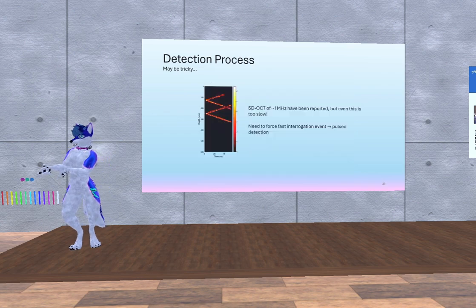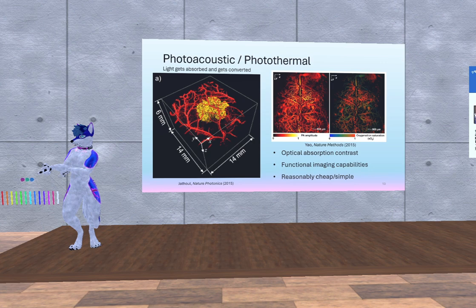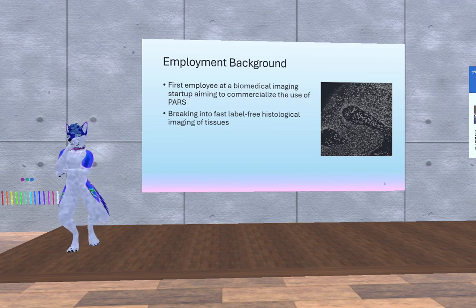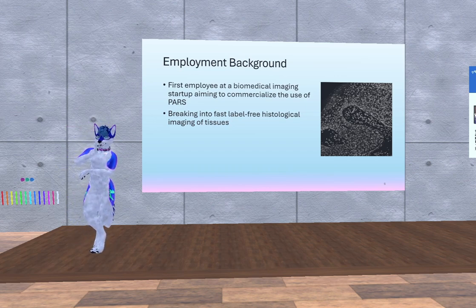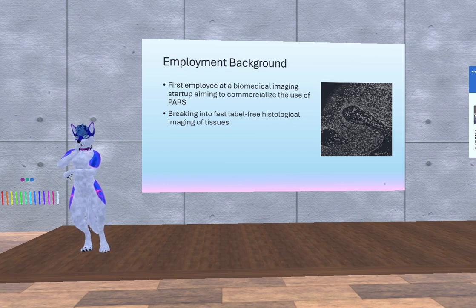By the old PARS, you're just talking about ultraviolet excitation PARS. That's like that background slide that was way back here. Is that what you're referring to? Yeah. We've never done any work with X-rays. The lowest excitation that we've ever really done is 250 nanometer. So you're in ultraviolet, which certainly denatures larger molecules like DNA. But it's an extremely useful contrast to take advantage of. It's still far less invasive than physically having to cut tissue out and do standard histopathology on it. Okay, thank you so much for answering my question.